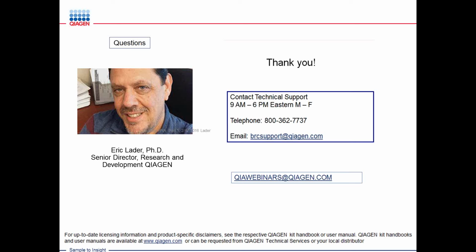So we have 15 people in the lab that are running sequencing, and we have 2 MiSeqs and a NextSeq, and 2 QIAGEN instruments, and 2 PGMs. And the MiSeqs run 24 hours a day. Yeah.